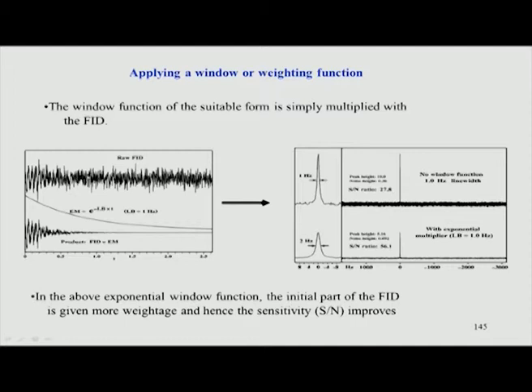Now, we have to convert this into a spectrum. So, before doing that, we do what is called apodization. Apodization is like multiplying this whole signal with an exponential decay. If I multiply this line, what you are seeing here, with this FID here, I will get this, this is the output. So, you see the signal is going down, down, down slowly and finally going to 0. Why did this happen? Because of this exponential decay. Because of the decay, the signal has gone to 0. So, you see what we have done is we have forced the signal to go to 0.